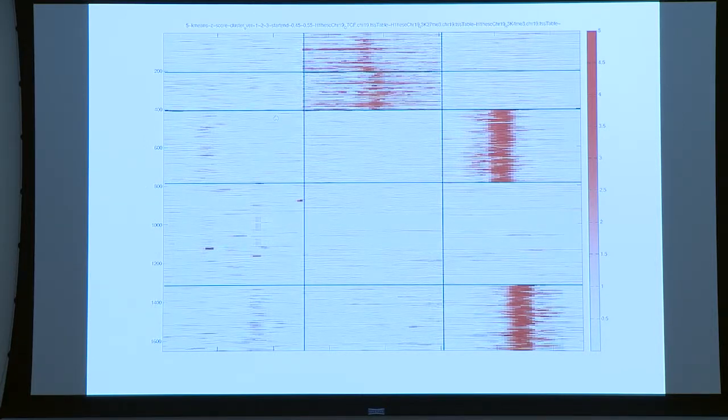In this case, it's not ordered according to the chromosome. It's ordered according to the signal. So it's not necessarily that this is where it is on the chromosome. It's more where is the highest enrichment of the signal. We've made K-means clustering of that, and within each block, the order is just according to the location.